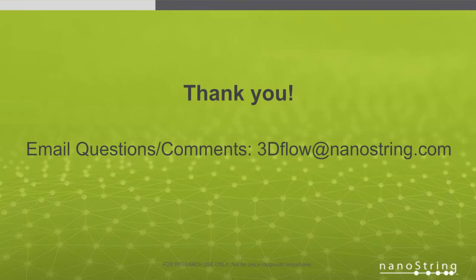Well, I think that depends on, again, the precursor cell frequencies. The primary limitation in the time is the time required for doing the flow sorting, and it's actually quite similar to what we would normally be doing for flow sorting. You have to prepare the cells. They have to undergo antibody binding and all of the pre-analytic preparation that is required prior to the flow sorting. But the primary amount of time really ends up being in the time spent on the flow sorter to be able to collect those antigen-specific cells.